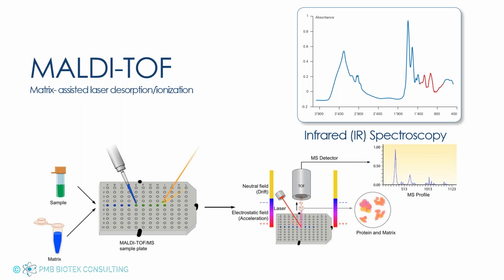The IR detection platform is really interesting. We're not actually looking at specific organisms in this case, but if you're working with a facility that has fungal contamination, IR spec can start to provide information on whether it's something that's recurring and it's the same organism that's there, or if it's a new organism that's coming into your facility and you're having contamination from an external source.